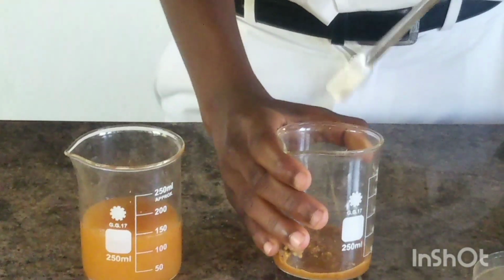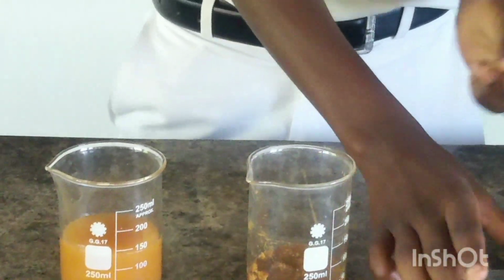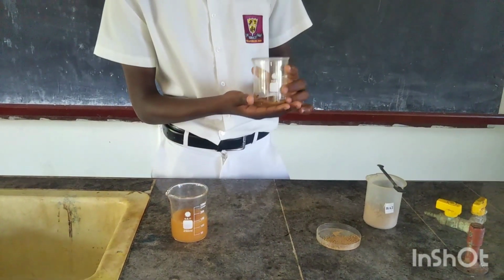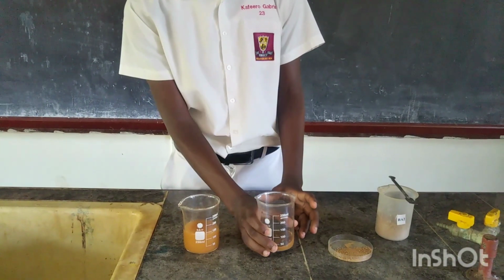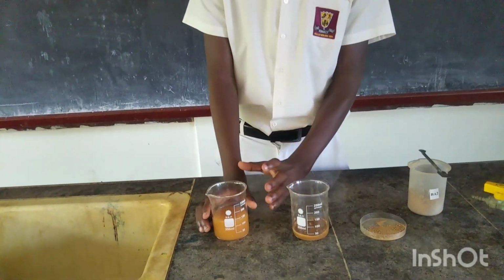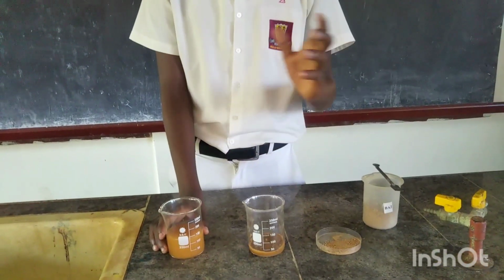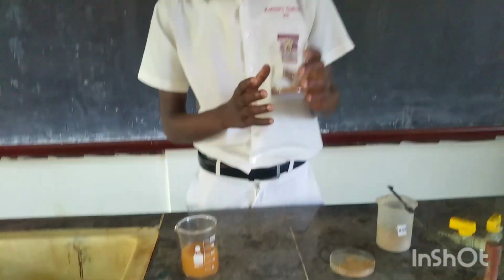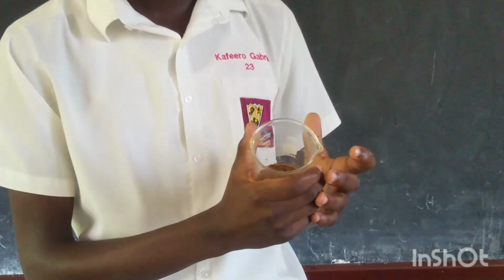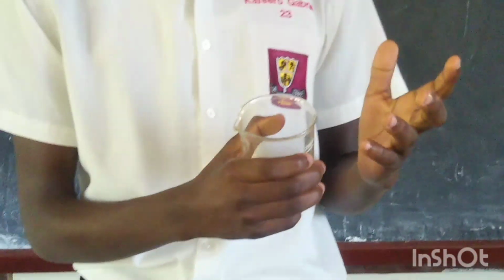Remember, before this, I just had my sand, mixed with nothing. Then I got my water here. But after mixing these two, you realize that the color of the water changed into brown because this brown color was contained by the sand. So after mixing these two, the color of the water changed to the color of the sand, that is, brown. But you can recognize now that these particles of the sand, as I told you, are a little bit huge, so they can't dissolve uniformly with this water.